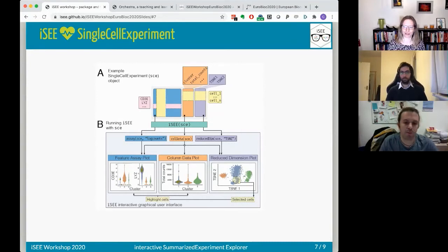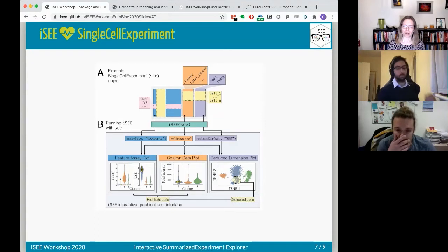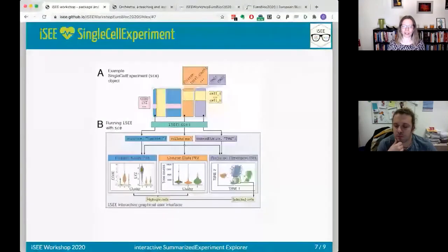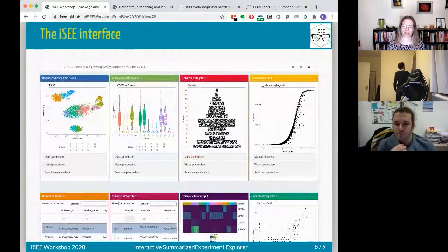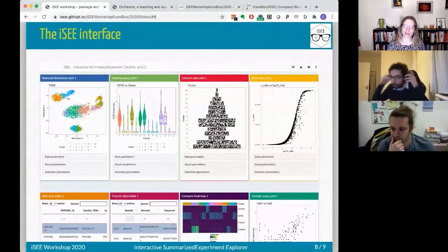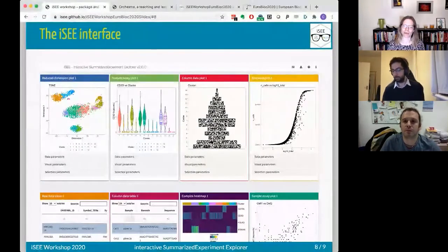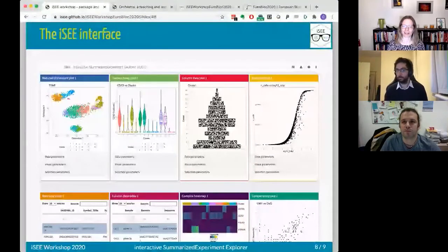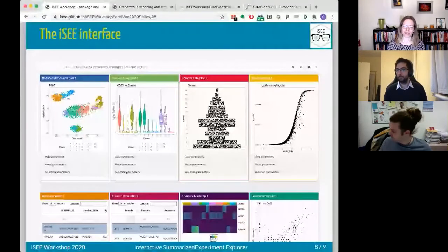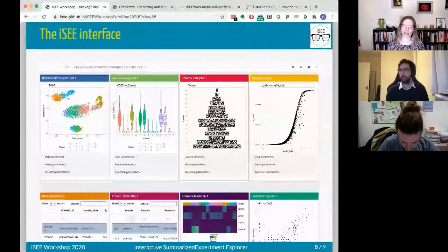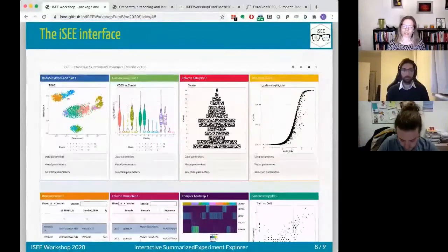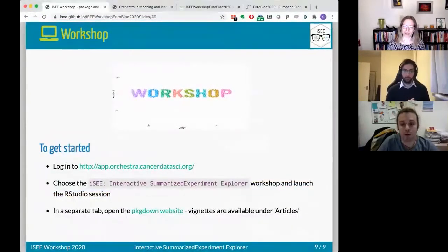iSEE integrates with the SingleCellExperiment or SummarizedExperiment objects: it extracts the different slots and visualizes them in different ways. Before the practical part, here's a quick overview of what an iSEE app looks like — with this particular single-cell RNA-seq dataset you get these different panels that let you explore your dataset from many different angles simultaneously in an interactive fashion.